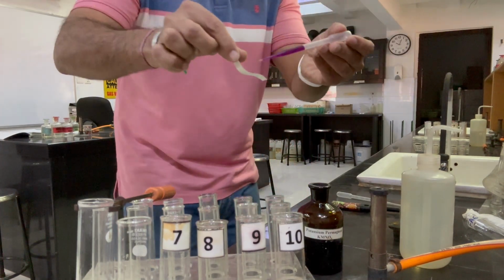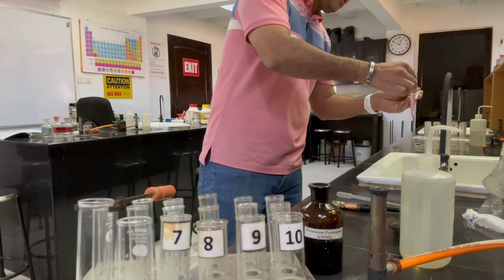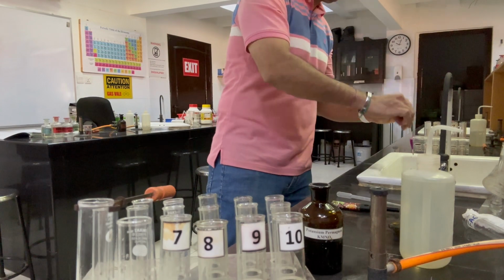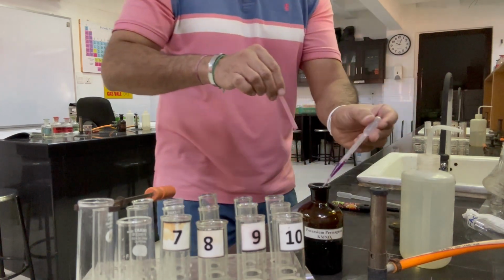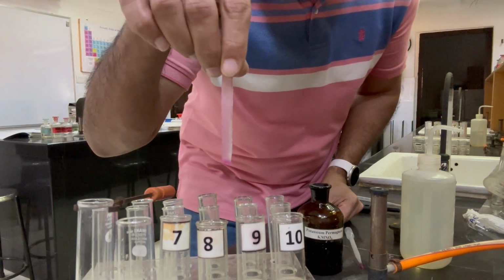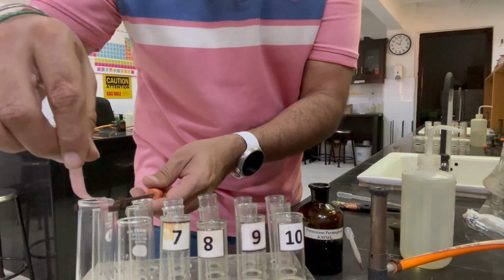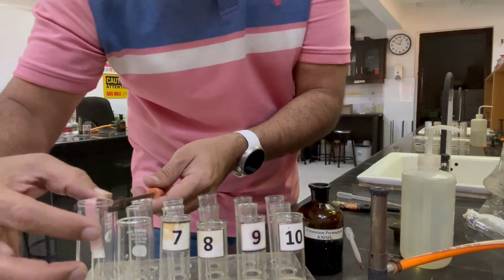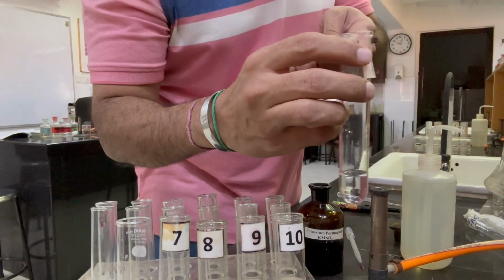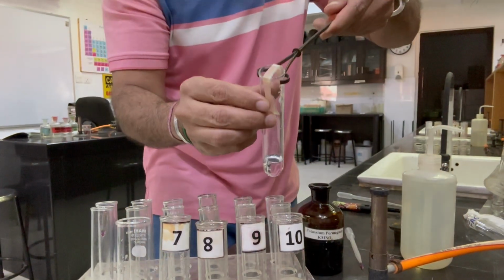We will put this here. Now you can see this is purple, and now we will add this on the top of this test tube. So it's here now. The exposed part is here, which is a bit purple.